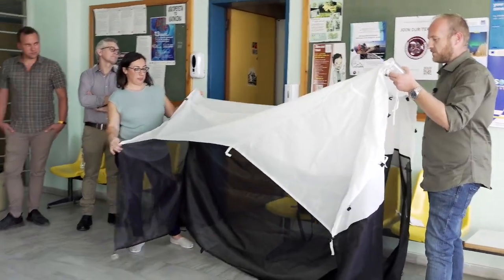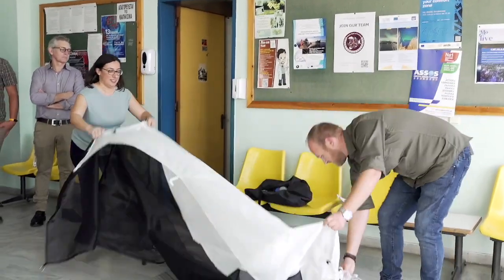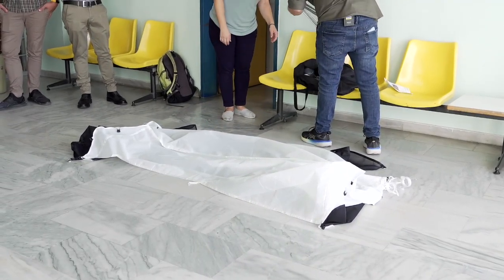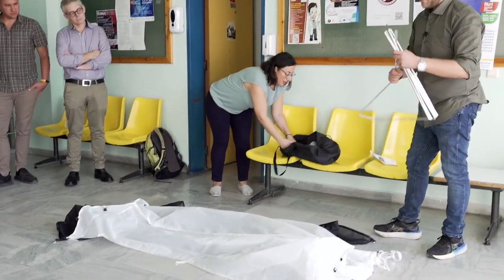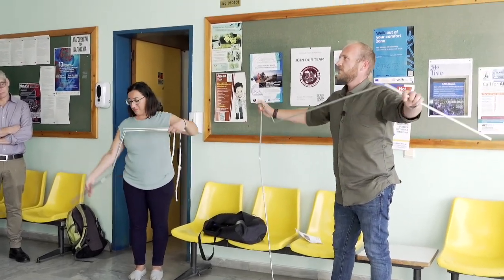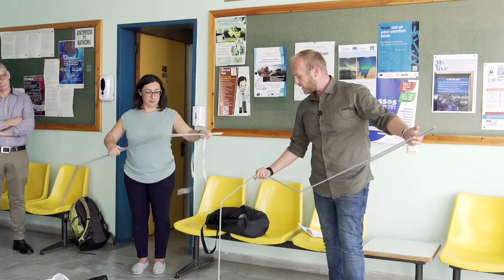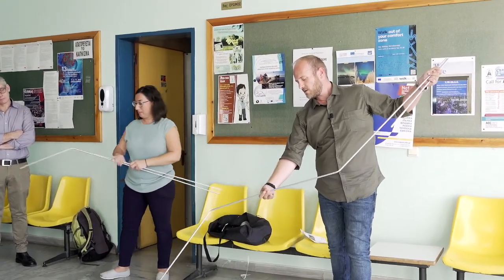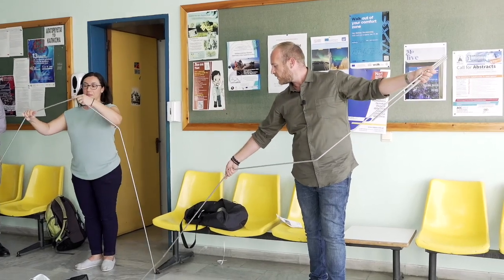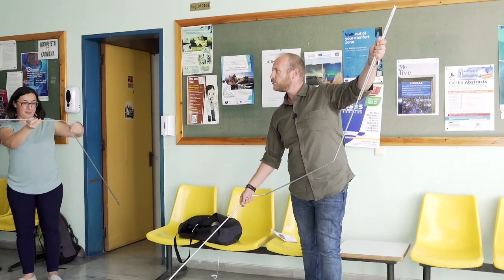It is a tent. We have to open the tent. We have to take the skeleton. We were lucky enough because these Malaise traps have a very good skeleton, because there are some Malaise traps with a very bad quality skeleton that breaks easily.